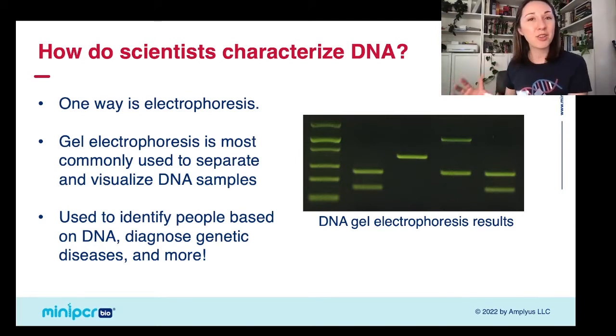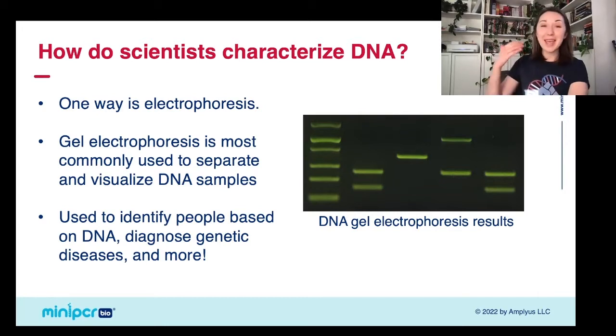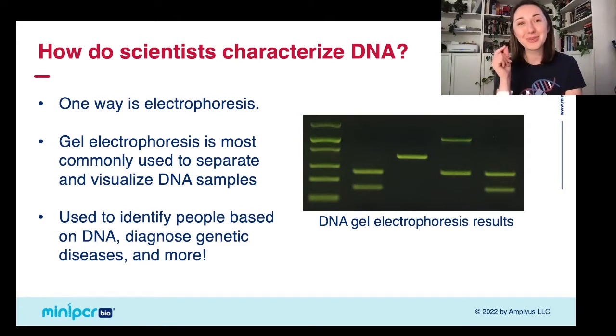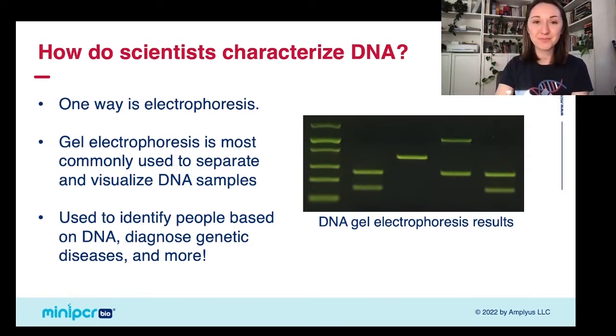And again, we're going to walk through some curriculum material later that talks about the processes that make gel electrophoresis work. But I think what's important to know right now is that electrophoresis is one of the most commonly used methods of visualizing DNA samples and separating them. And the ability to do this allows researchers and scientists to be able to identify people based on DNA, to be able to diagnose genetic diseases, and to run almost every scientific experiment in the genetics lab. You will almost always have to do some sort of visualization and gel electrophoresis. So it's a really important tool.